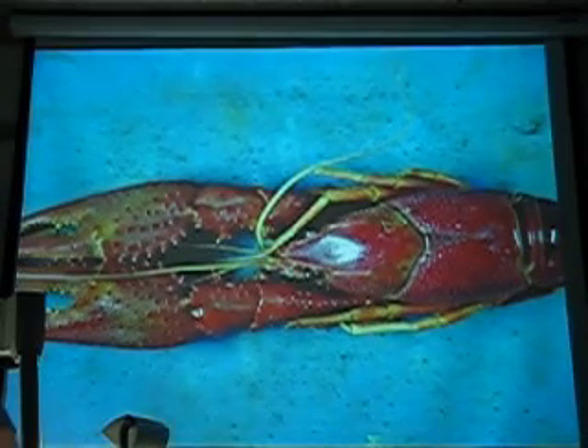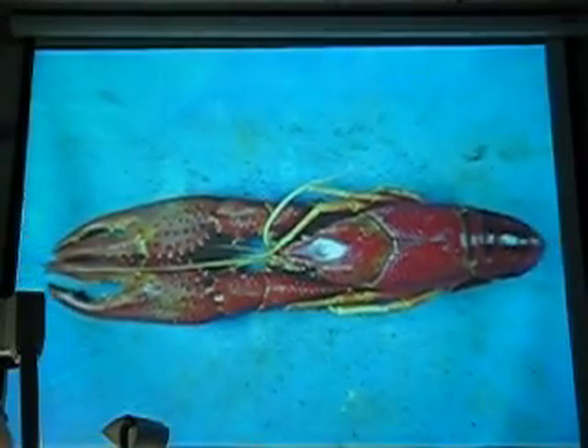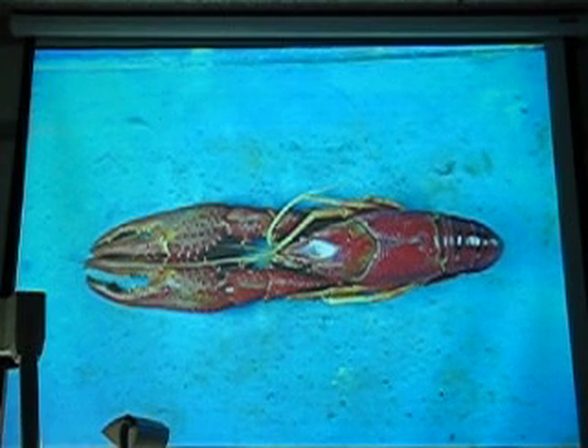What phylum is this? This is phylum Arthropoda. No, phylum Velasca. Phylum Arthropoda. Arthropoda.